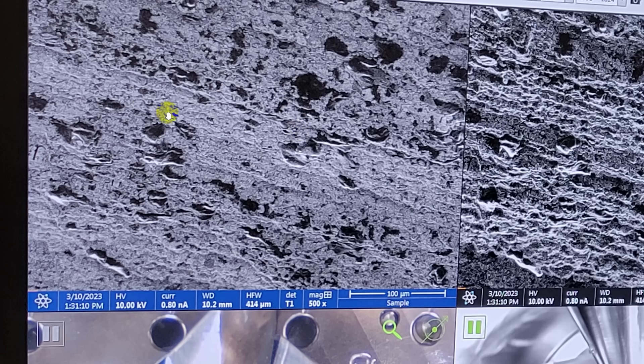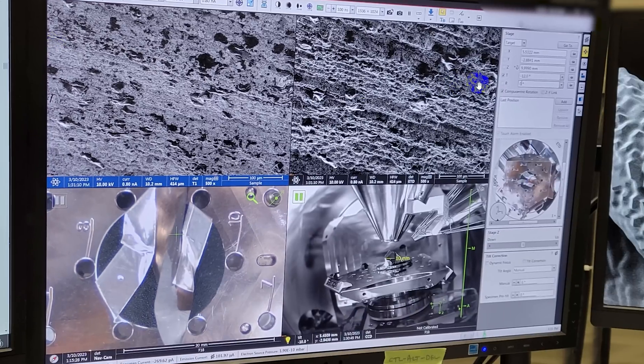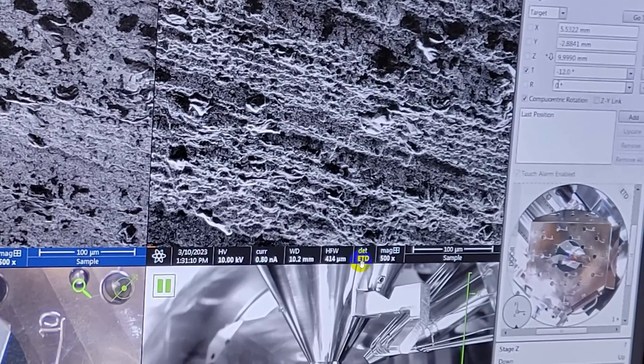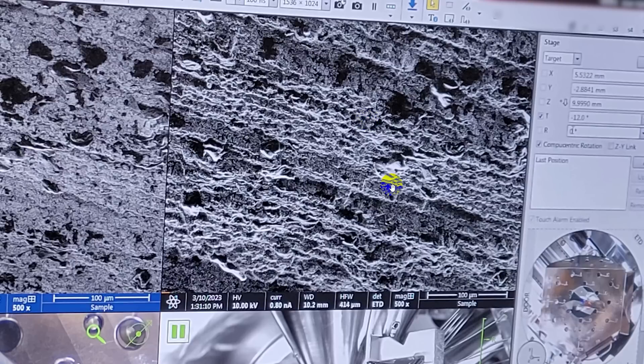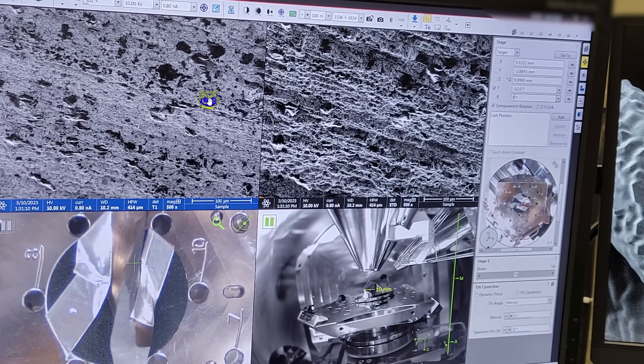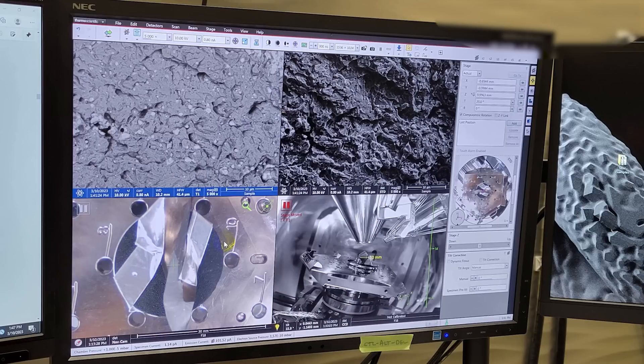And then up top here we have two images and these images are coming from different detectors. The image here on the left is from the T1 detector, which is an annular ring located around the source where the beam is coming out, so it's catching electrons that are being scattered directly back. And then over here on the right we have an ET or an Everhart Thornley detector. This detector I believe is off to the side so it's catching secondary electrons that are coming out of the side of the sample at a low angle. And you can see you get a different kind of an image. In the case of the back scattered electrons here coming directly back into the T1 detector, we have a very flat image that doesn't show a lot of the detail of the surface texture. Where with the detector off to the side, we get a much better idea of the 3D surface of the sample.